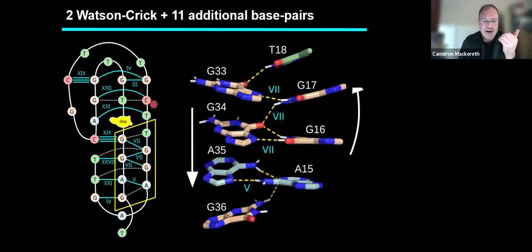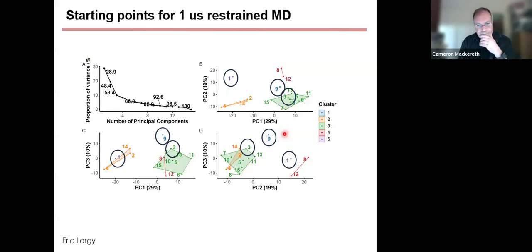And this already partly explains both the top and the bottom part, why we see so many exchangeable hydrogens that we don't normally see. It's because, well, they're not standard Watson-Crick. And in fact, all of them are involved in very strong hydrogen bonds.